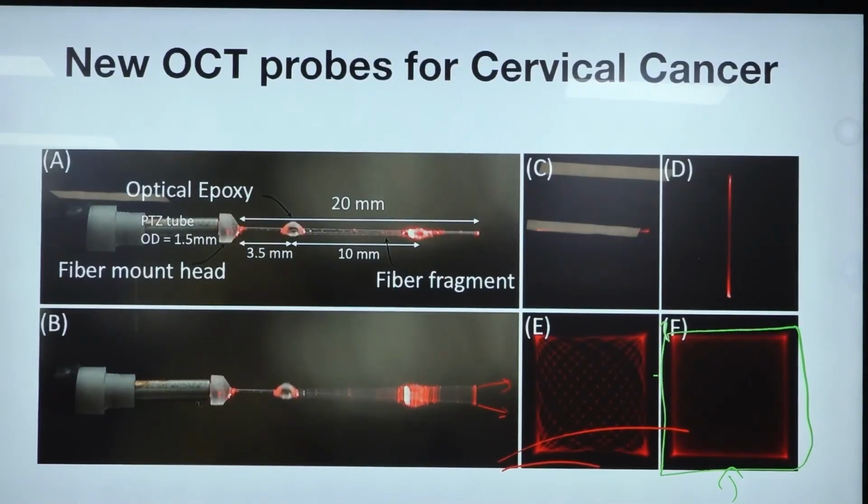That's why we wanted to make it perfectly horizontal and perfectly vertical. When you apply zero voltage along the y-axis, you want it to be x and nothing else. That gives you full precise control, and the control is really the crucial piece. As long as it's predictable, it's okay. And a straight line is a very predictable thing. That's a good question. Any other questions? Any questions on that?